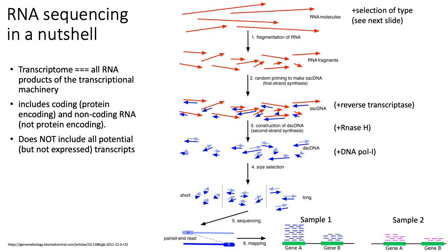So let's jump to the basics of the RNA-seq protocol. Here on this slide, I'll illustrate the basic RNA sequencing protocol. It's worth noting that RNA-seq has been going on for well over a decade now, and so there are actually many different RNA-seq protocols for many different scenarios, like if you're working with FFPE samples versus just primary tissues.